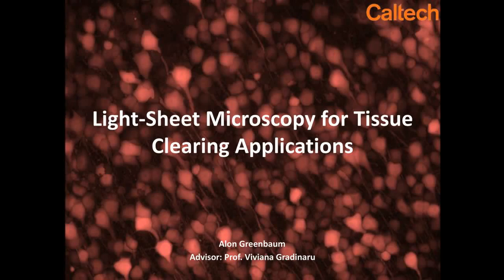And of course, most of the time we want to do live imaging, so we have phototoxicity. So again, this is a take-home message: spatial resolution, temporal resolution, imaging depth, and phototoxicity. All of these parameters should be based on the photon budget, because we are doing fluorescence.